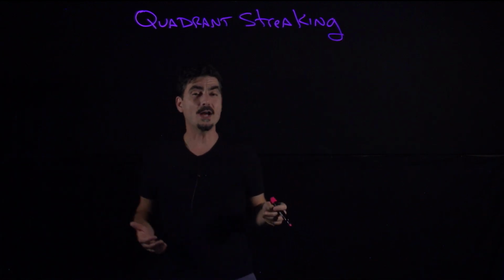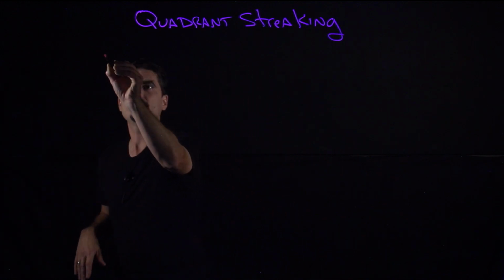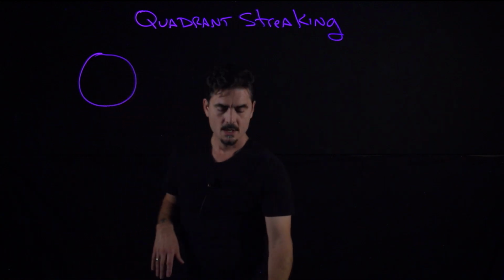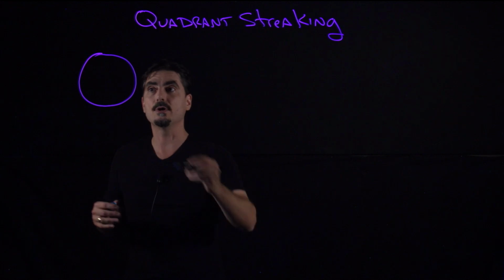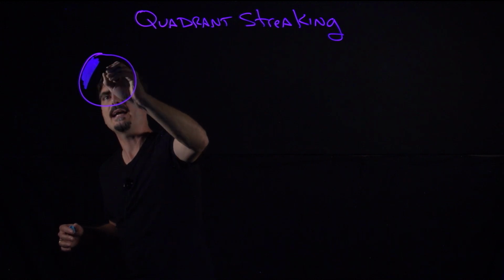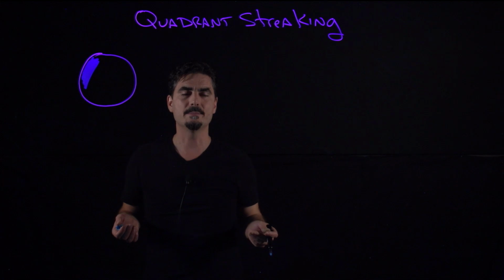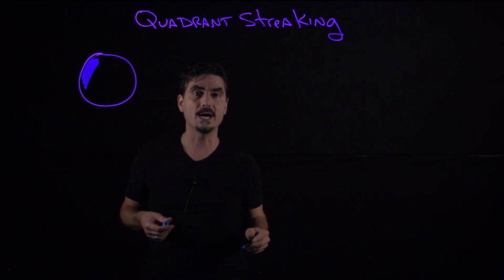So by the fact that we've got quadrant means that there's 4 components to it, right? And so if we have a Petri dish, which I'm drawing here, in general, you always put in quadrant 1, you kind of paint it, which means that you go back and forth, back and forth, back and forth. Often, for example, in the first lab with Ubiquity of microorganisms, we're taking a swab, and so this is what we're doing with the swab right here.